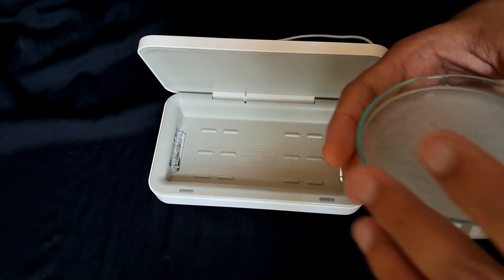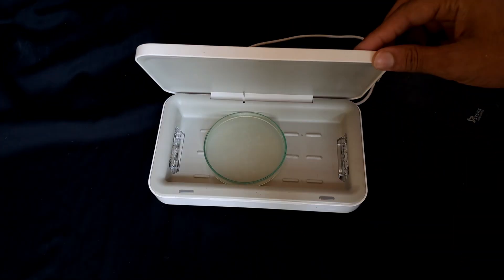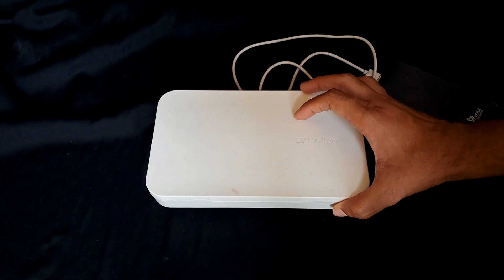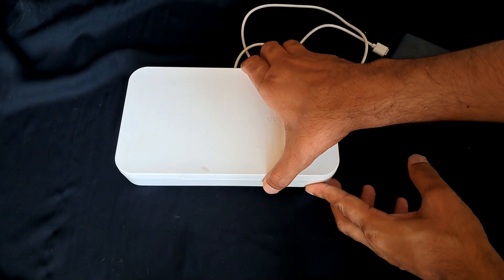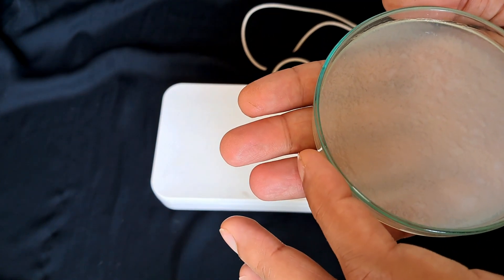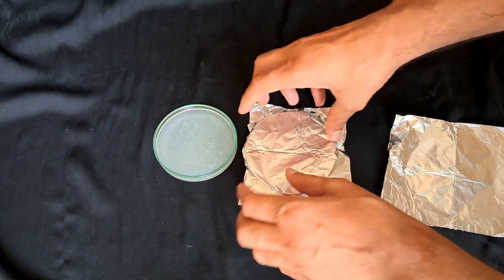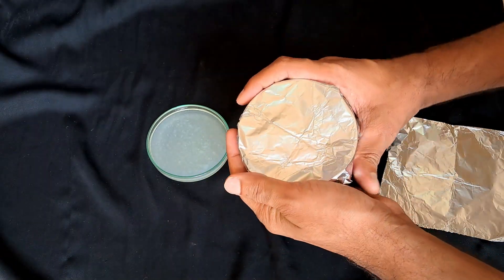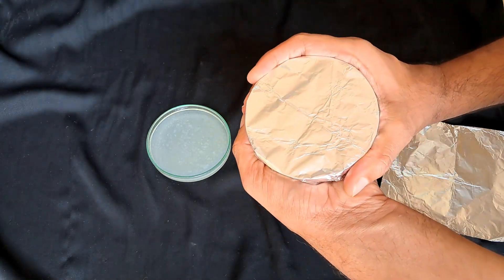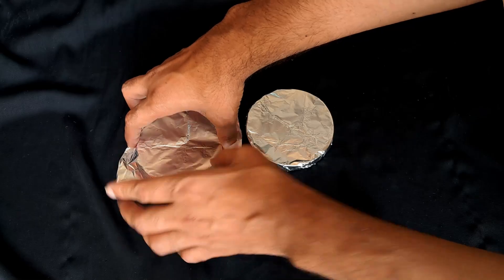Let's get back to the experiment. I will place the small dish in the UV sterilizer and the other one will remain as it is. I have sterilized the sample for 20 minutes — enough for the bacteria to have its growth inhibited or get killed. Covering the dishes with aluminum foil to avoid any contamination. We don't need marking since the smaller one is UV sterilized and the bigger one is the control.